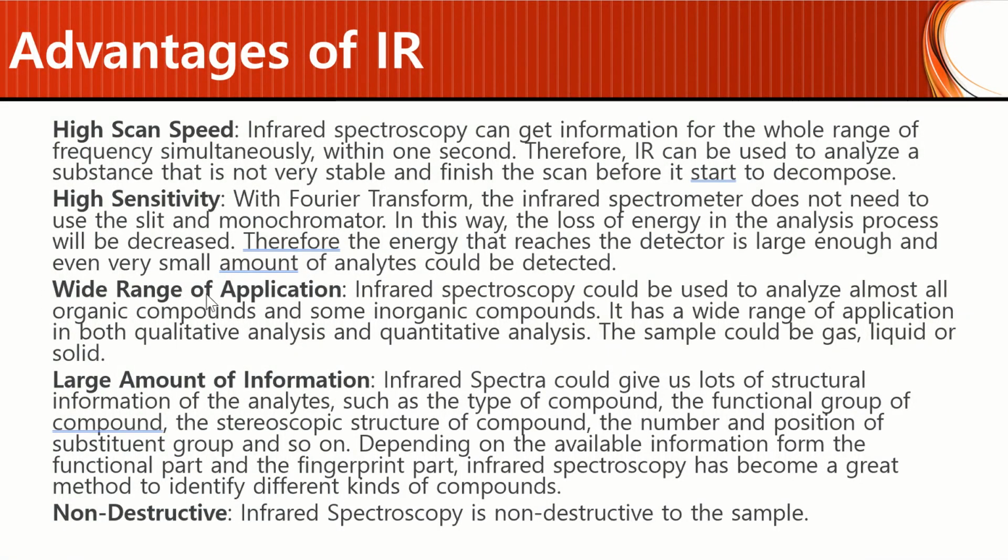Another advantage is the wide range of applications. So IR spectroscopy could be used to analyze almost all organic compounds and some inorganic compounds. It has a wide application in both qualitative analysis and quantitative analysis. As we saw, the sample could be gas, liquid, or solid, so that's nice as well.